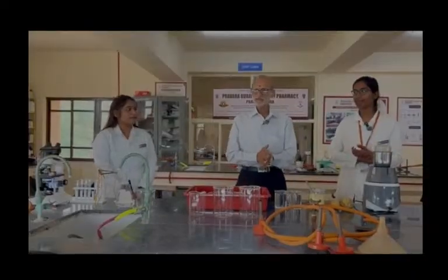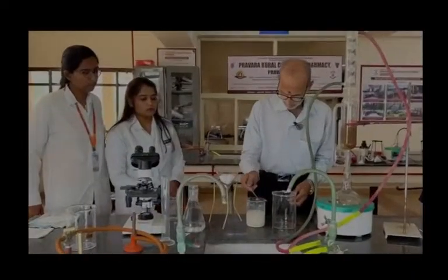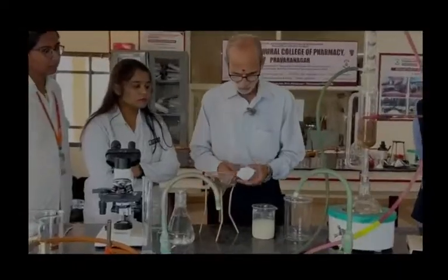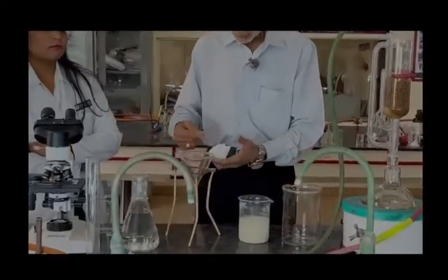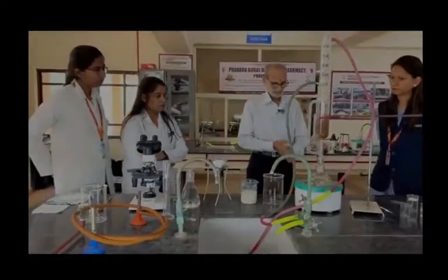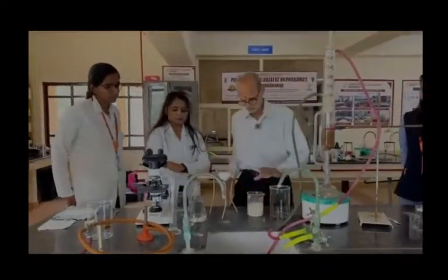We are going to begin with filtering the pulp from the mixer. Bhakti is going to do that. This is called the fluted filter paper, and the entire area is now available for the filtration. Okay, all right. This has started.